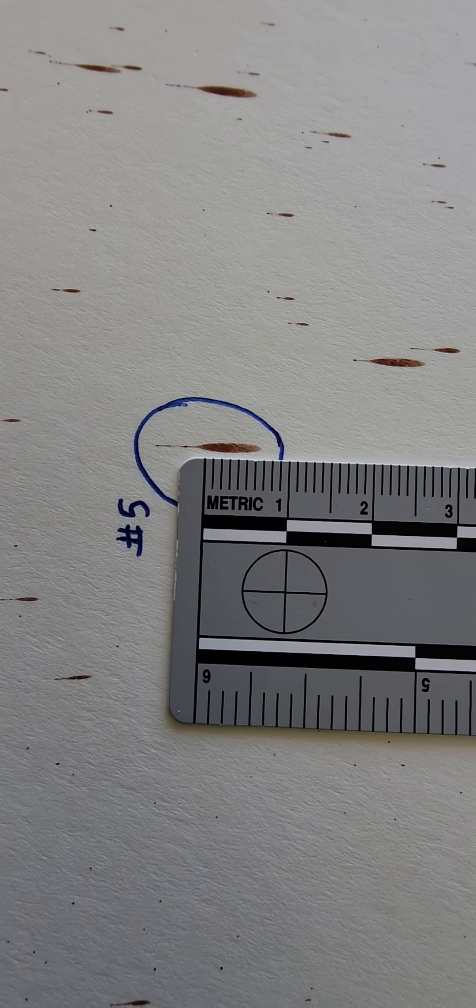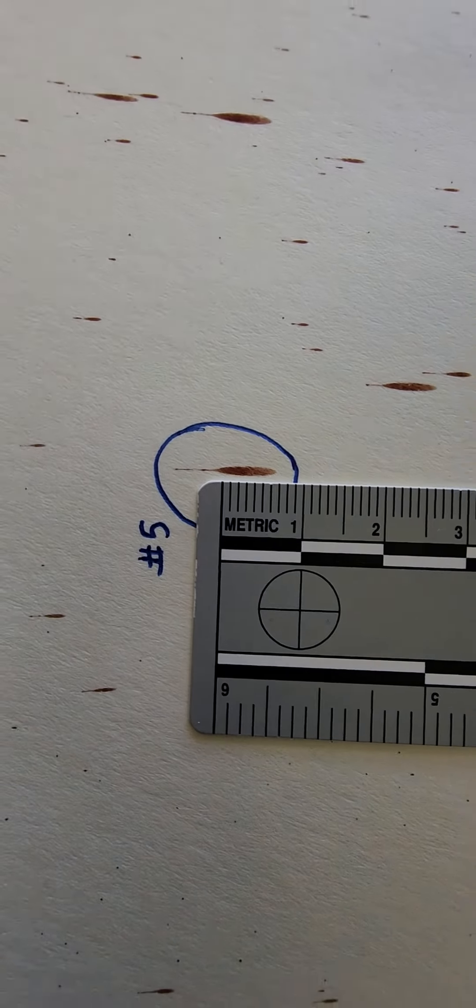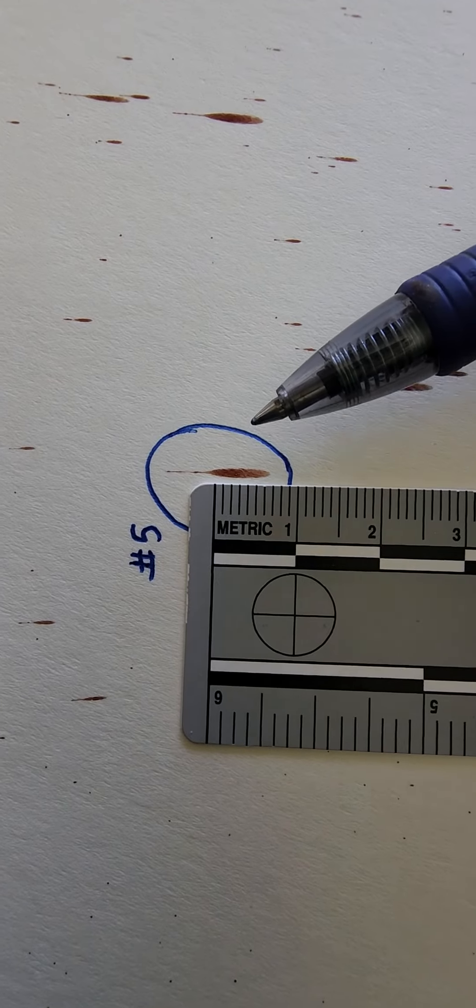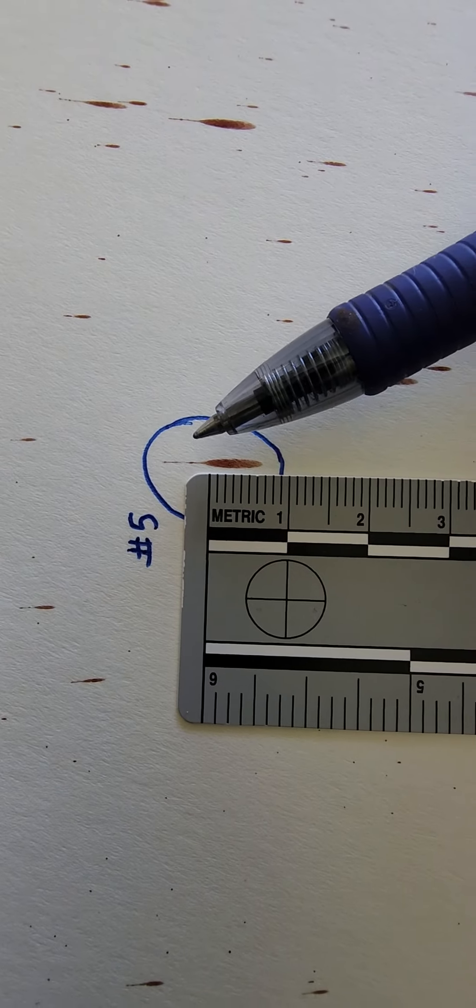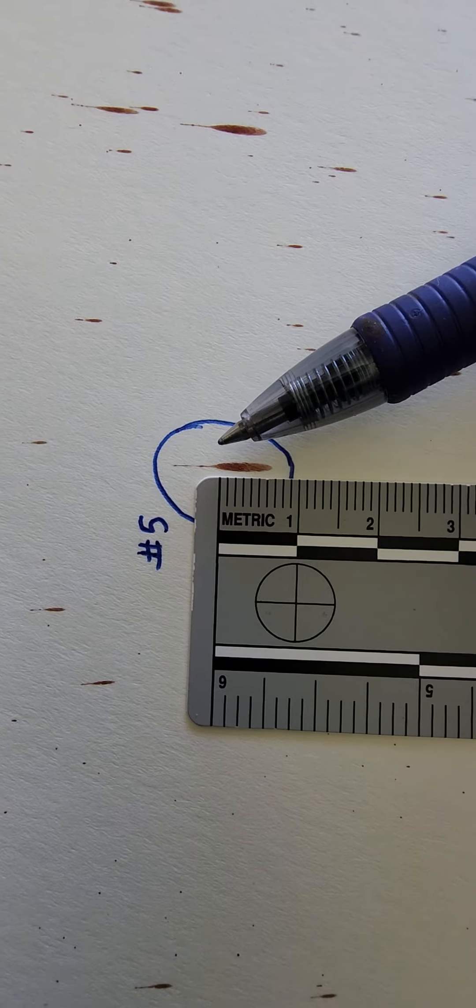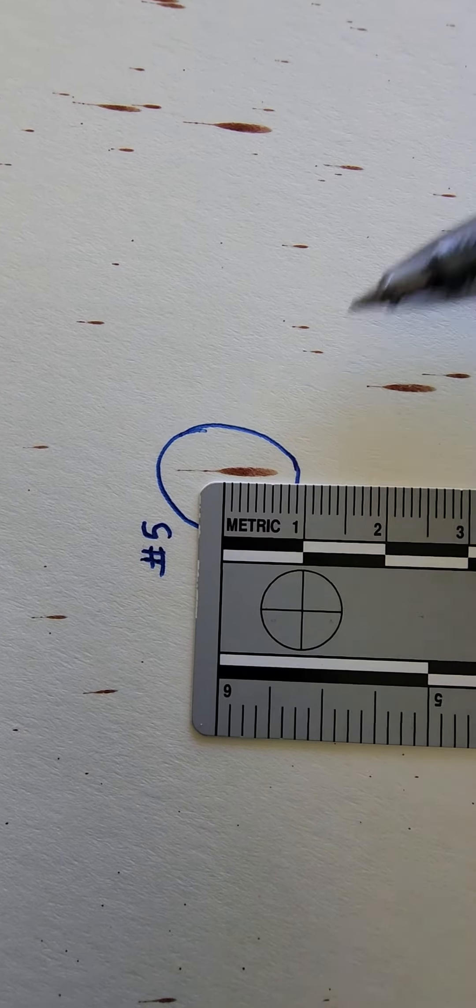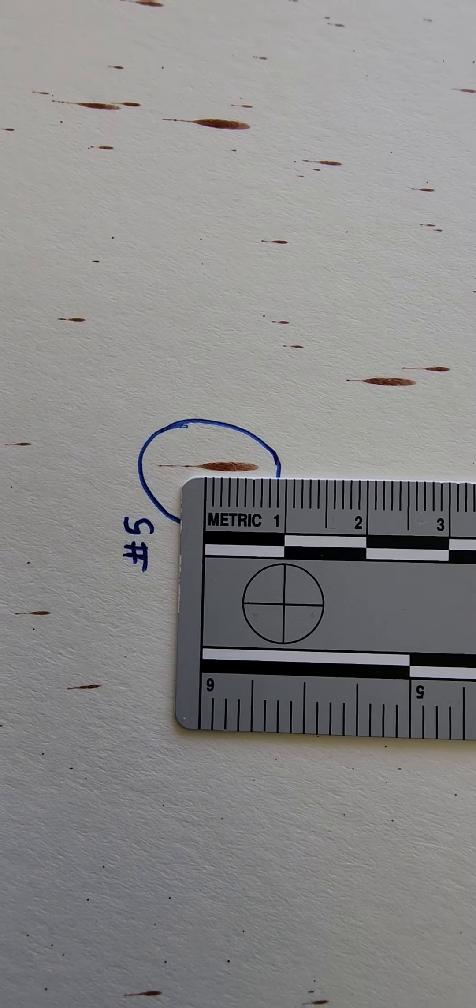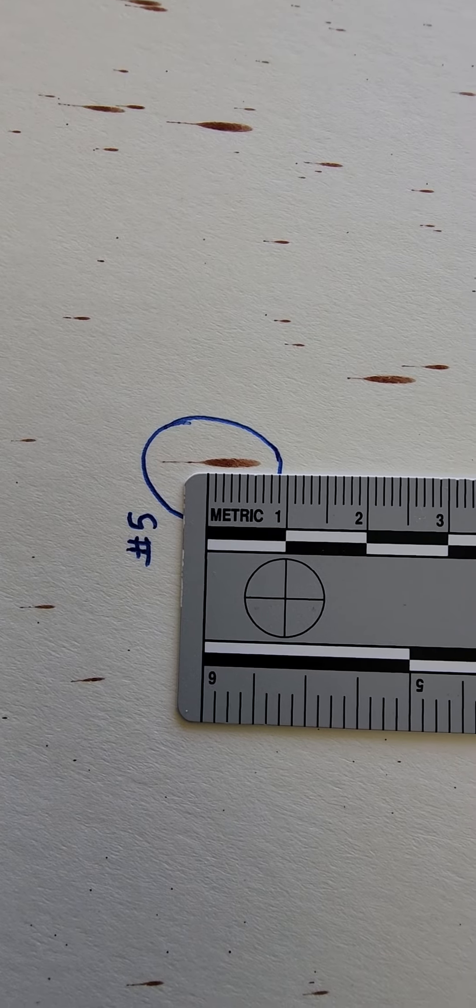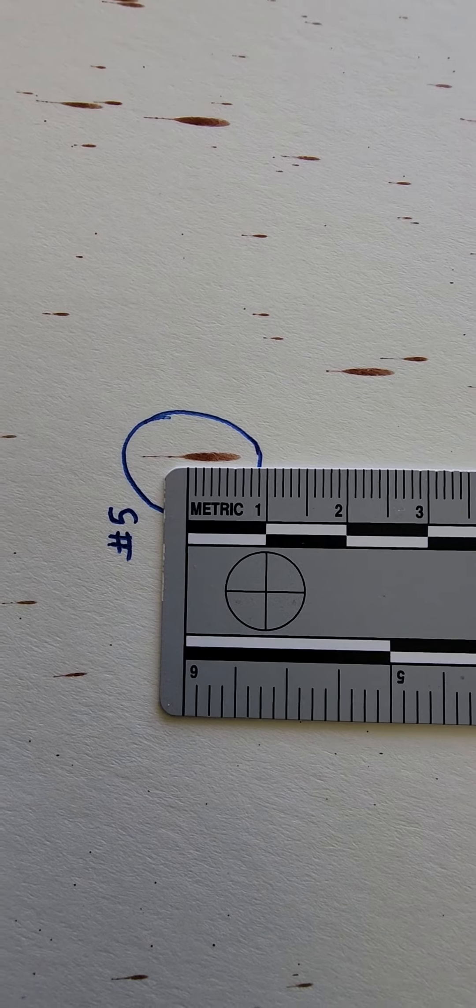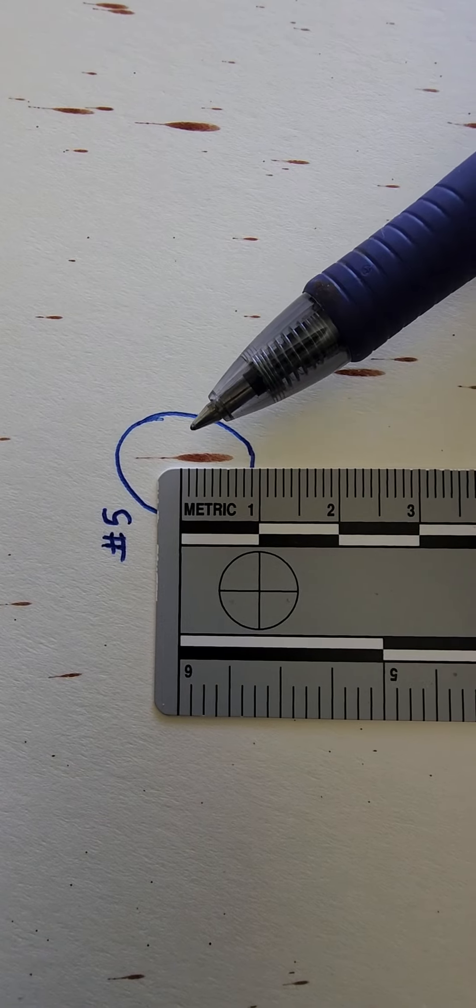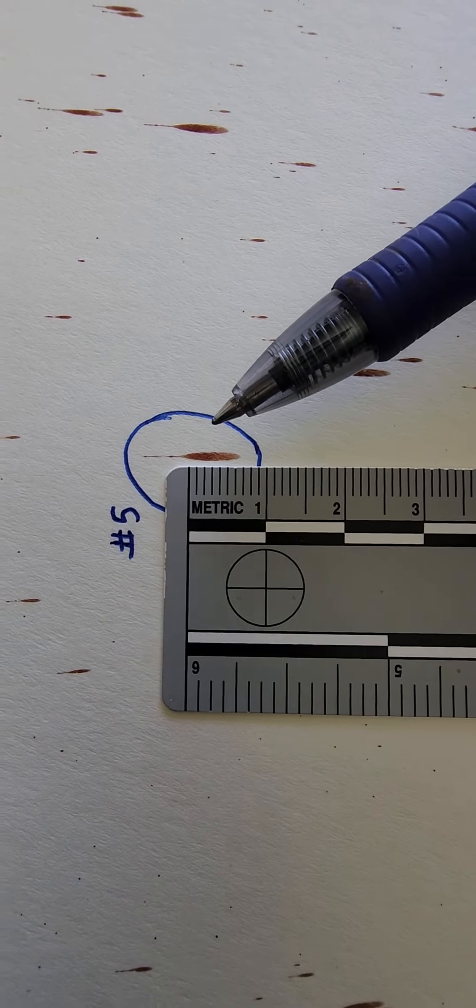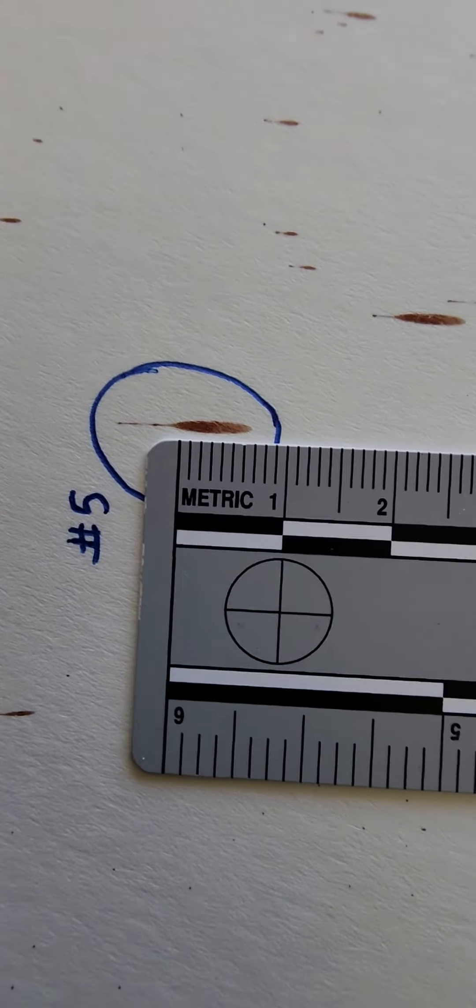But when you go to do the calculation and the measurements, if you're measuring an individual elliptical stain, you do not measure all the way out to the end. You don't measure this little tail. That's almost an artifact of the blood hitting the surface and then kind of dragging across the surface. So all you're going to measure is just this little elliptical part in the middle. That's the actual stain part that you're going to use for your calculations.